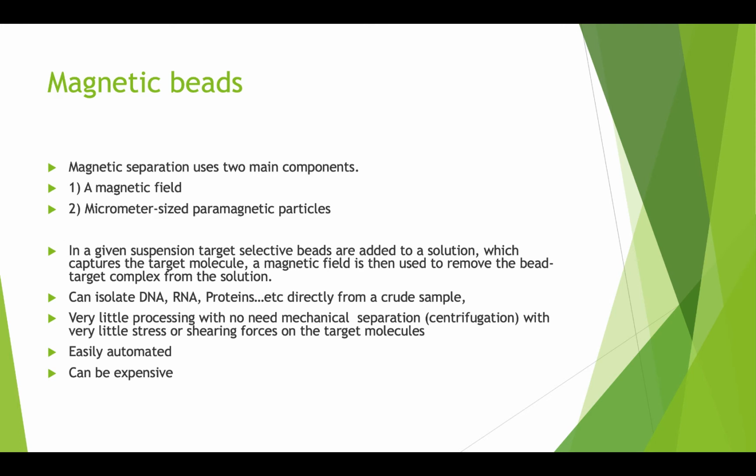And then you put these beads, which can be selective. This is in the first homework you will see, so you can go through it. So the selective beads are added to a solution which then captures the molecule that you're looking for. The default form or the first form is the iron-based ferrous form of these beads that binds DNA, any DNA.